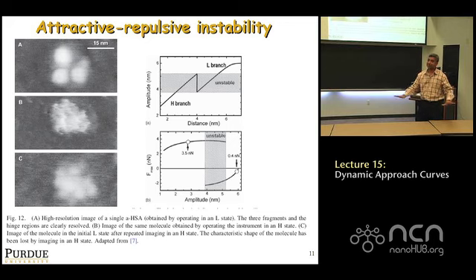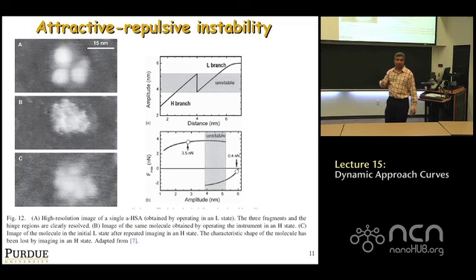It flattens pretty much this antibody. All right. And in C, what they did is, after flattening it by operating in the repulsive regime, they switched back to the attractive regime by changing the set point, and scanned again, and look what happened. Which means that this particular sample, by switching to the repulsive regime, you were applying such a high force that you basically completely inelastically just smashed it, so that it did not regain its original shape after you got back to it.